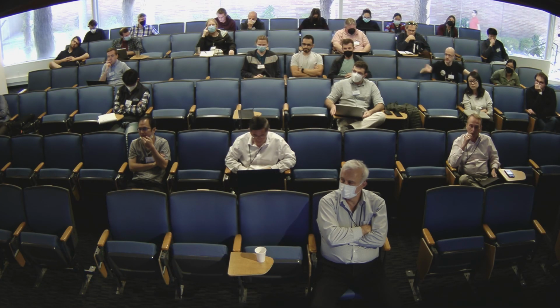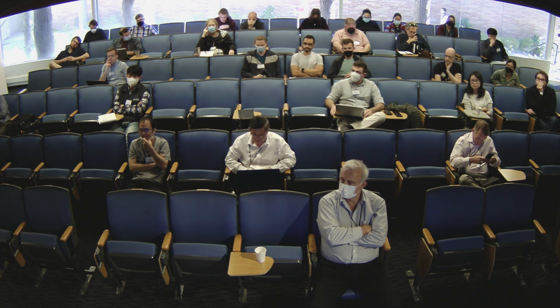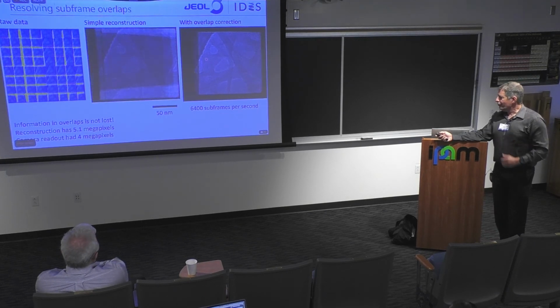Does your software extract or export this mask too? You could do this yourself as a user if you had that. You absolutely could. Right now, the software that does this is a bunch of cobbled together MATLAB code that only I know how to run. But I mean, it works. It's tricky, but it works.